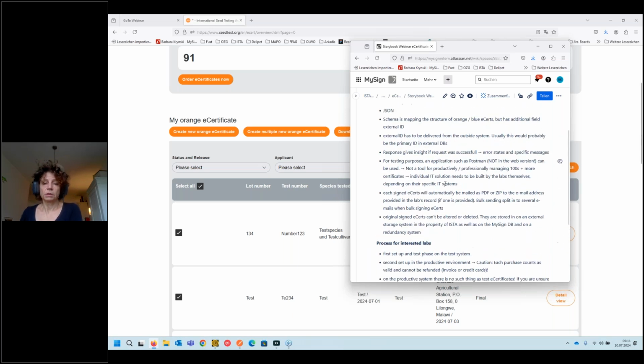And one more thing about altering certificates: if you're not quite sure whether everything is correct, or whether there might be an error in your certificate, just keep it in a provisional state. Provisional states, also provisionally signed, can be altered, but not the original signed. That's really important, because otherwise you lose 10 francs if you detect an error just after signing it.